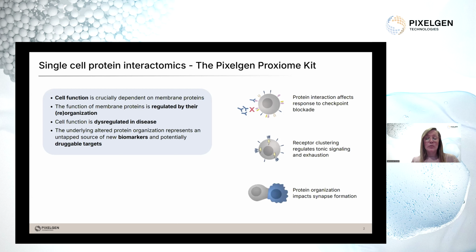Of course, maybe the most well-known example of where we have a lot of protein reorganization is during cell-cell communication. For example, during synapse formation, you will have really big, large-scale changes in the protein organization. And this really enables the cell to respond in a directed manner, to really only release its response towards a cell that it's in close contact with. And this is, of course, particularly important for cytotoxic immune cells, where you want to kill a tumor cell or a virus-infected cell, but you really need to make sure to not damage any surrounding tissue, for example.